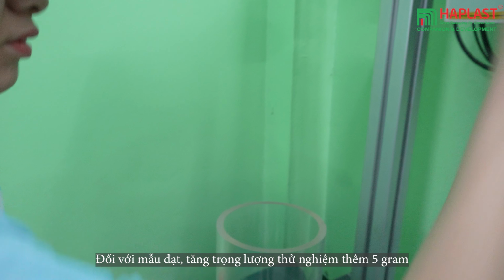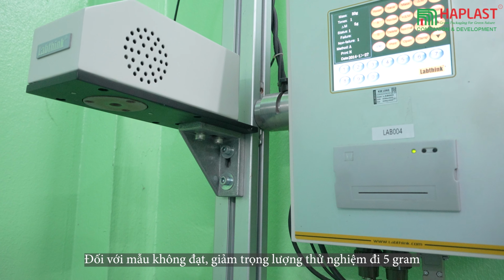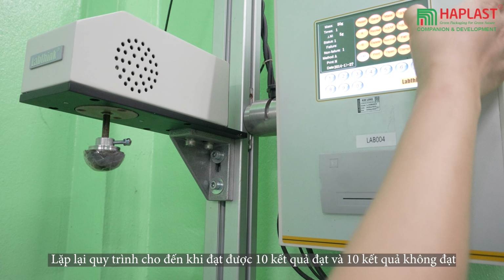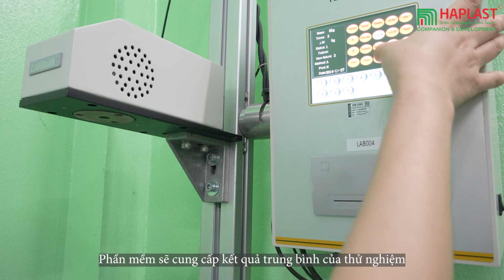For passing results, increase the test weight by 5 grams. For failing results, reduce the test weight by 5 grams. Repeat the process until there are 10 pass results and 10 fail results. The software will provide an average test result.